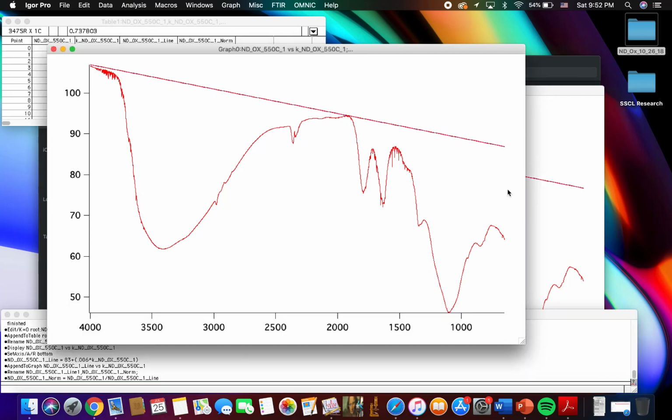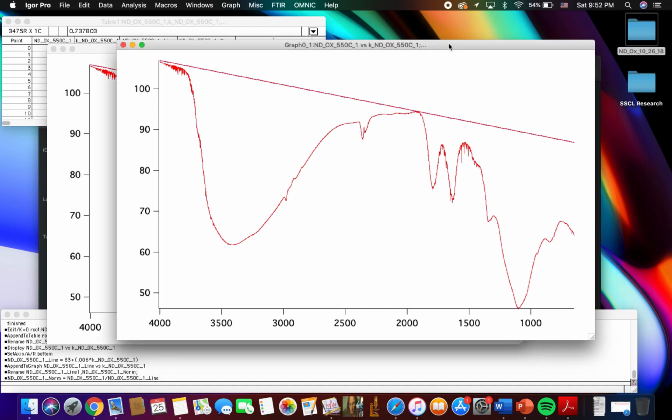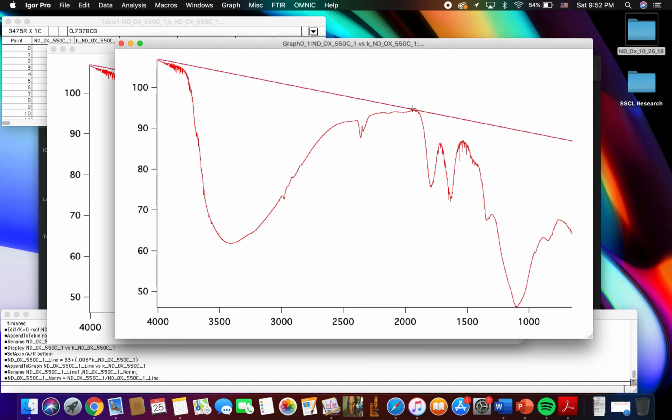It'll just keep updating itself, and then you can see how it changes, how it looks, and see if you're doing it correctly. But for now, it's going to look pretty decent considering where the line is at and how the data points and the wave are. So we don't need to change anything.